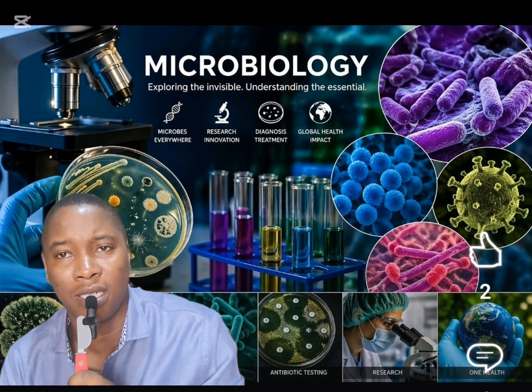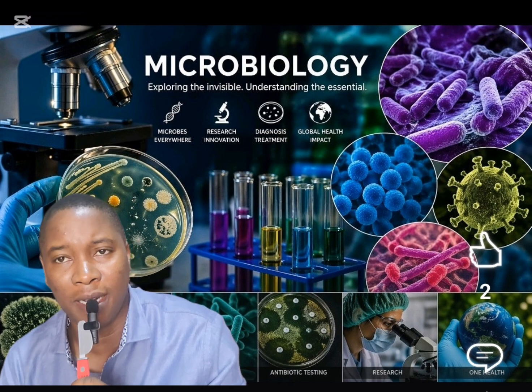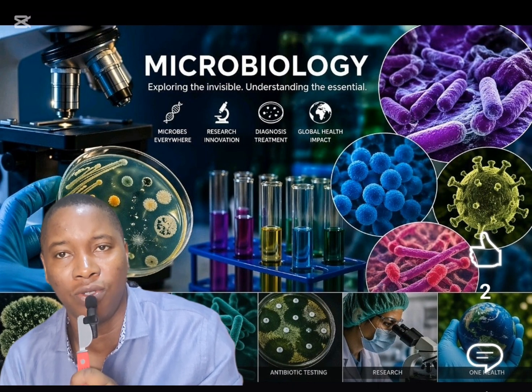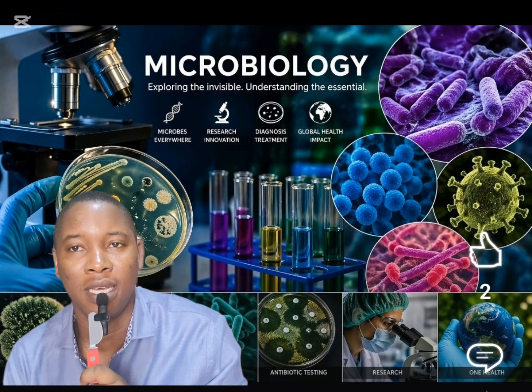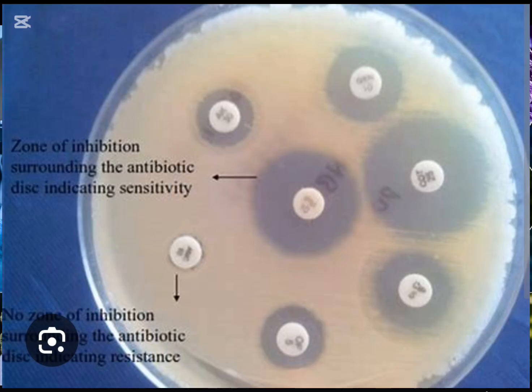And in the event that your bacterial suspension is too thick, you can dilute it with normal saline, and this is important. So we usually have a bacterial suspension of all the bacteria that we want to test our antibiotics against. And then when we have this bacterial suspension, we compare with the McFarland standard. If there's a need to dilute, we dilute until we are sure that it has been standardized. And then we inoculate all these standardized bacterial suspensions onto our Mueller-Hinton plates, and then we put our disc over them and allow for about 24 hours of incubation. So this is the process, and it's very important.